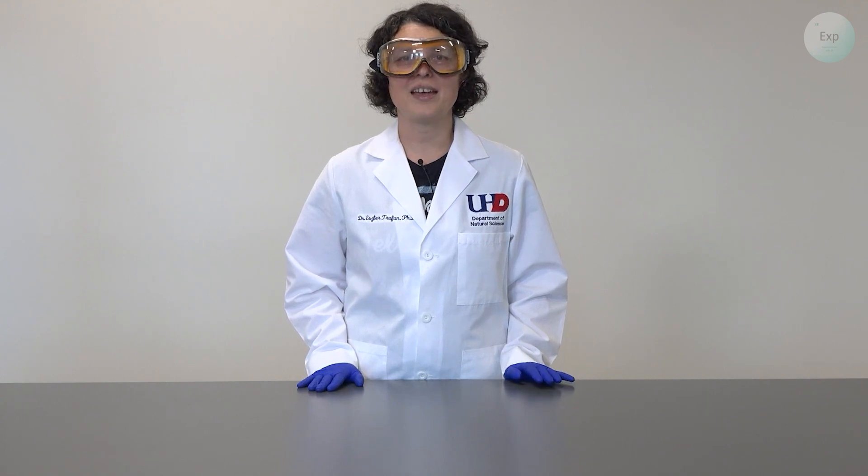Hello, my name is Dr. Esther Trufan and in this video, we're going to observe a gas-forming reaction.